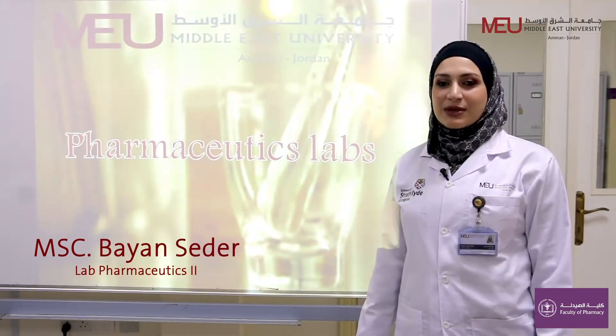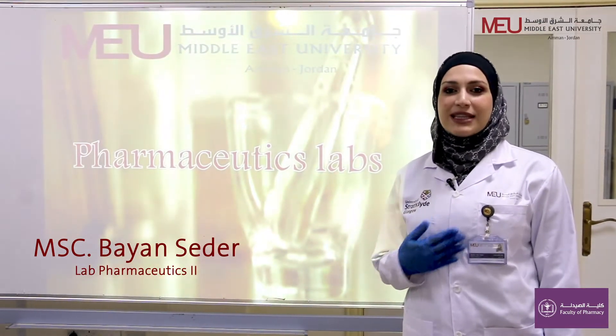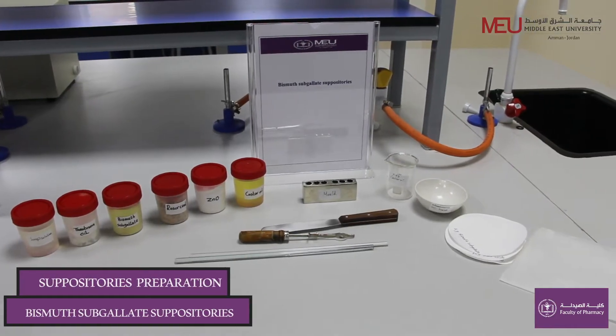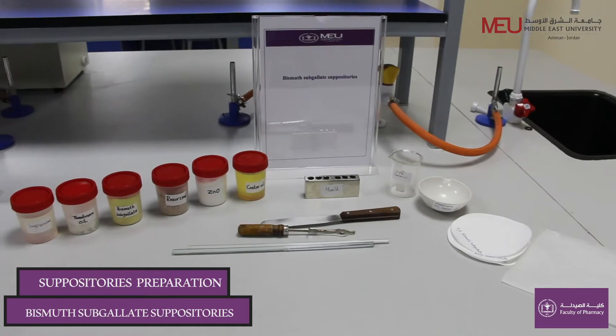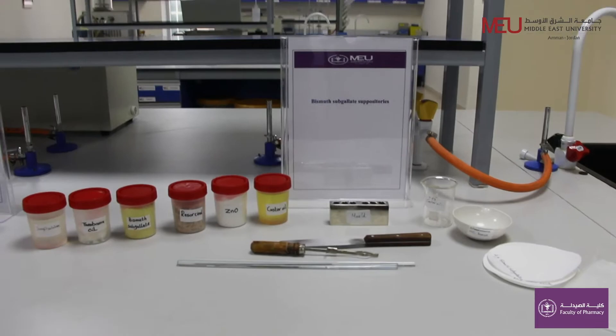Hello everyone, welcome to pharmaceutics lab. I am pharmacist Bayan Sader from Faculty of Pharmacy at Middle East University. In this video, I'm going to discuss how to prepare 10 bismuth subgallate suppositories which are used for treatment of hemorrhoids.